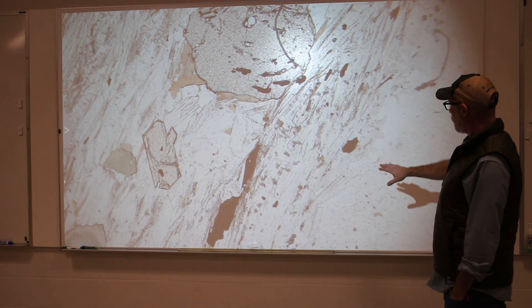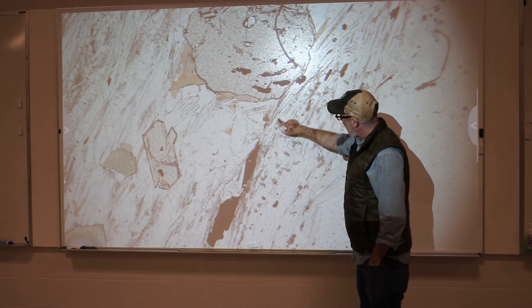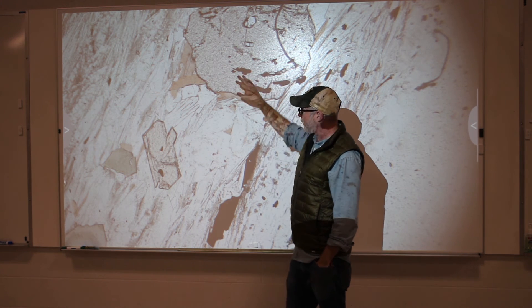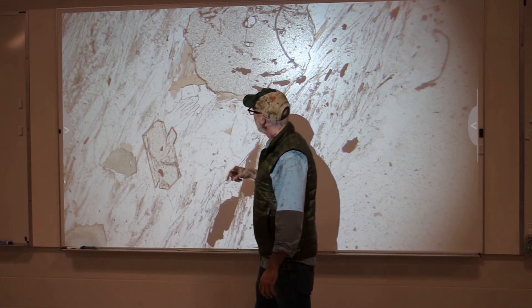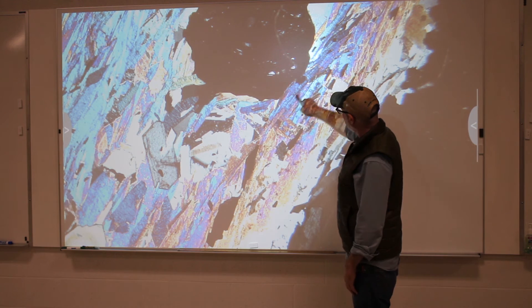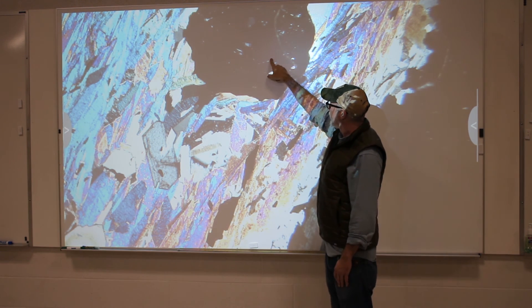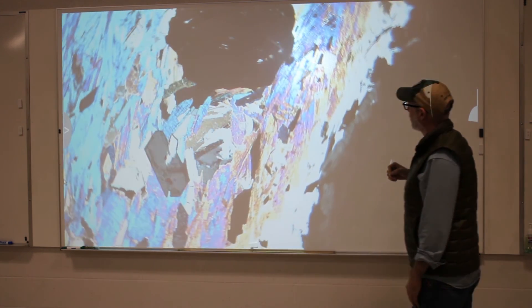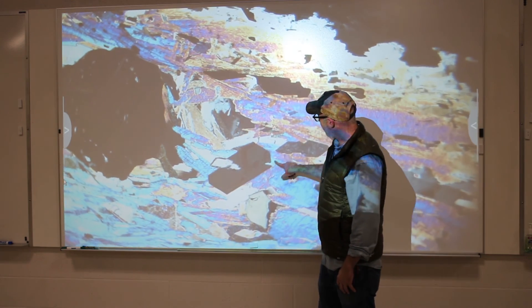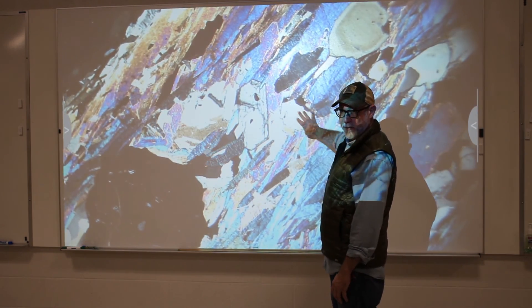Here we have a thin section view at relatively low magnification — about 40x — of the schist we looked at earlier downstairs. You can see a lot of clear minerals that don't really stand out visually, but also some clear minerals that do stand out, and some other larger minerals. Crossing the polars, where we put the top polarizer in, we now see that all of these long minerals show bright colors — we call those interference colors, the result of their birefringence. This mineral is our garnet, and if you rotate the stage the garnet stays black the entire time. Our muscovite mica changes with rotation, and we also have secondary minerals which turn out to be tourmaline and staurolite elsewhere in this rock. So this is a pretty classic medium-to-high-grade Appalachian schist.